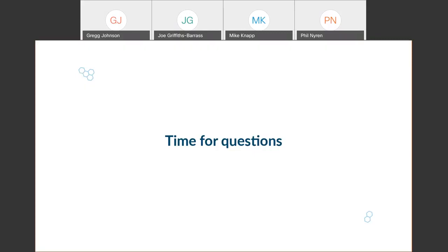It also collects the data, its flow rates, in an onboard memory, so that if you want to download it later for analysis, then you have that also as information you can tap into. So it really is not only a process improvement, but also you can use it to analyze and improve your process over time. So hopefully that's helpful for you. Yeah, it's a really good bit of kit, isn't it? Another question that came in.